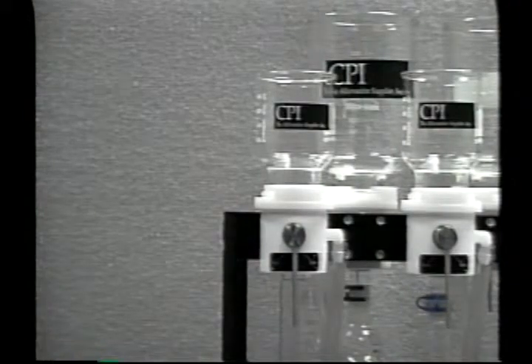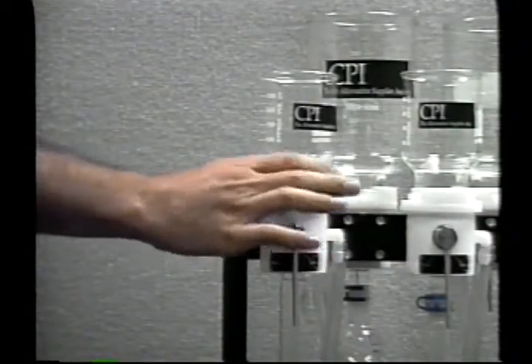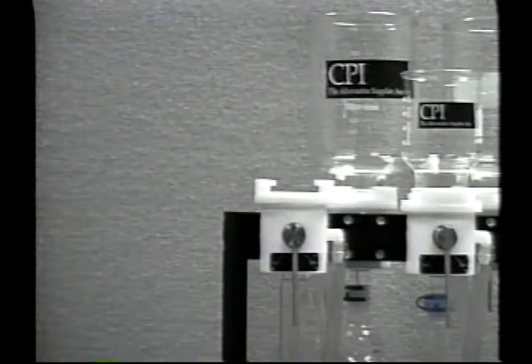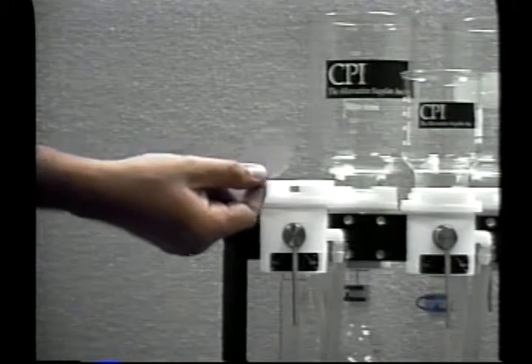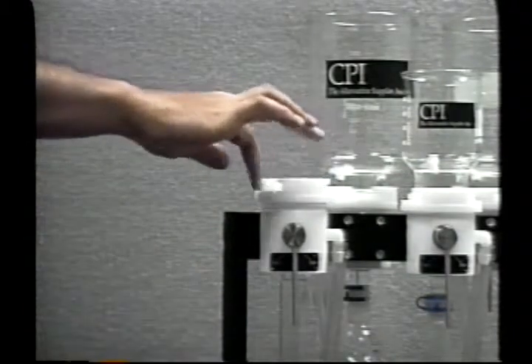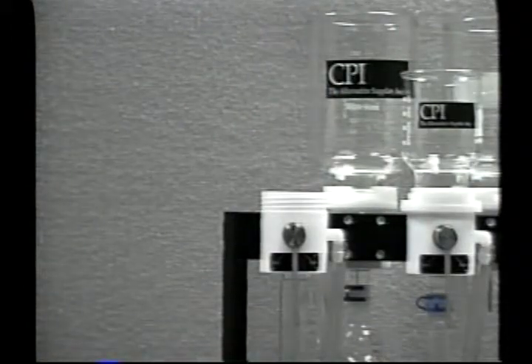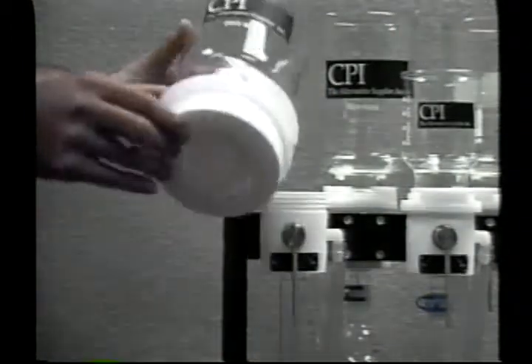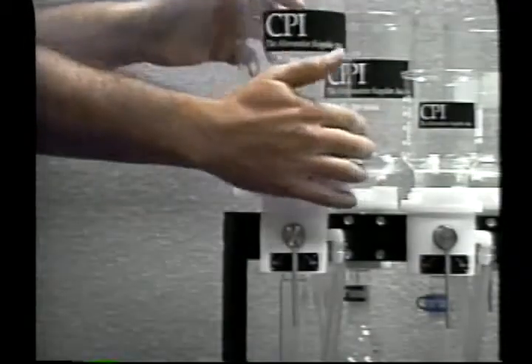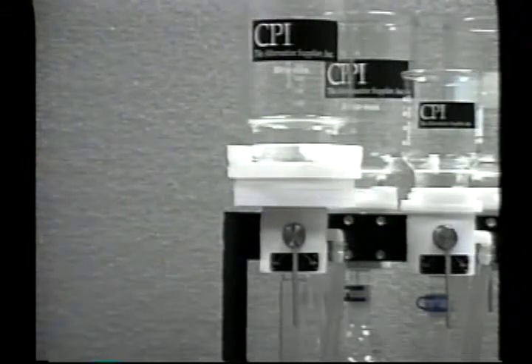In order to convert from a forty seven millimeter to a ninety millimeter extraction station, simply loosen the retaining ring, remove the glass, at this point you'll also need to remove your stainless steel support screen, and then completely remove the retaining ring from the forty seven millimeter position. At this point the complete ninety millimeter extraction station can simply be screwed onto the forty seven millimeter station and is now fully operational.